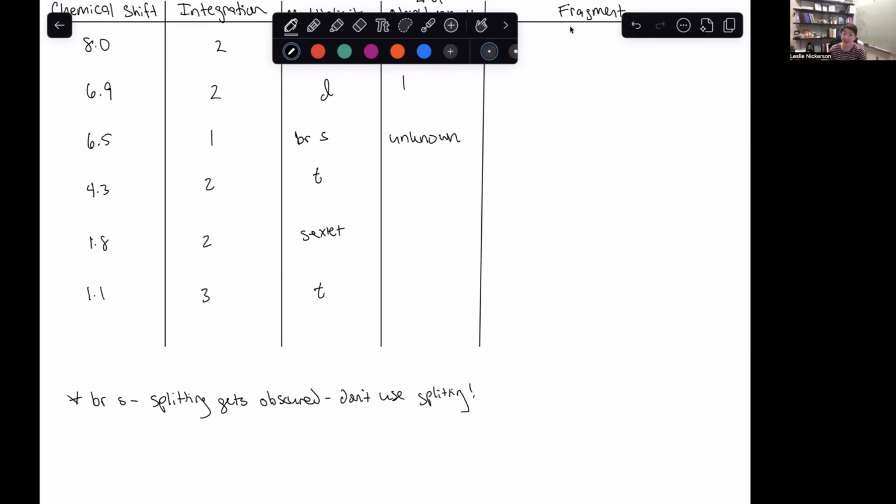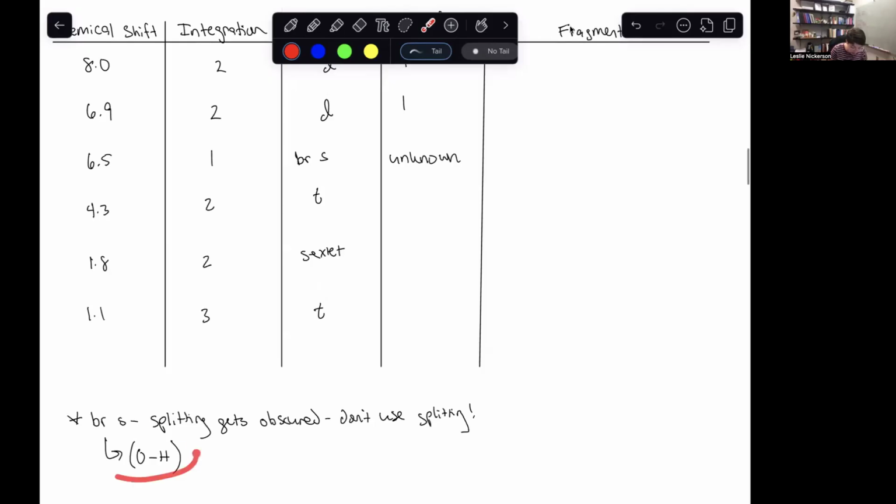Okay, don't use the fact that it's a singlet. It might be tricking you on that. But generally with a broad singlet, we're thinking about OH. It's generally going to be some sort of acidic proton that's doing a lot of exchange with the solvent. So it's kind of appearing and then disappearing, and that's leading to that broadness of the peak. So it is helpful to just note that, yeah, it's probably an alcohol. And we saw an alcohol peak in our IR. So that's, again, two pieces of information that are coming together with each other.